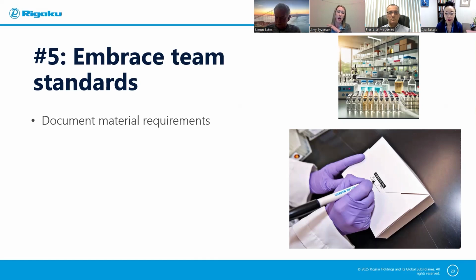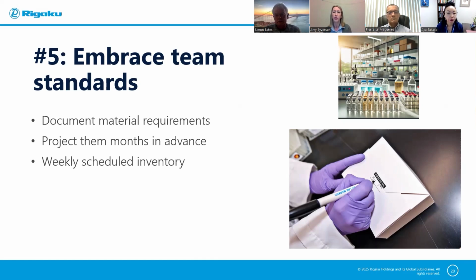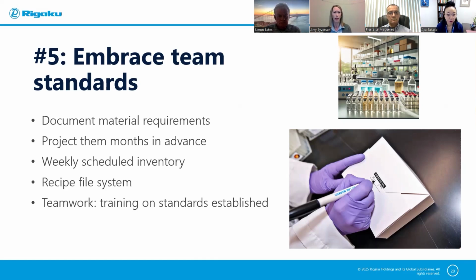Maintaining consistent logs and recipe files further supports the accurate preparation of stock solutions. Regular inventory checks guarantee that the material ordered will be here in advance of when it's needed. And by establishing clear team standards, consistency and efficiency become the foundation of the team's operations.